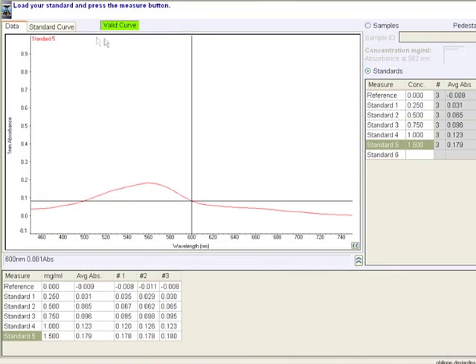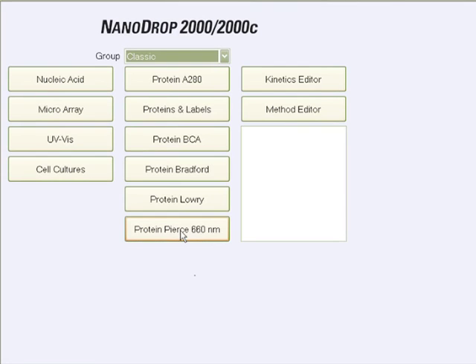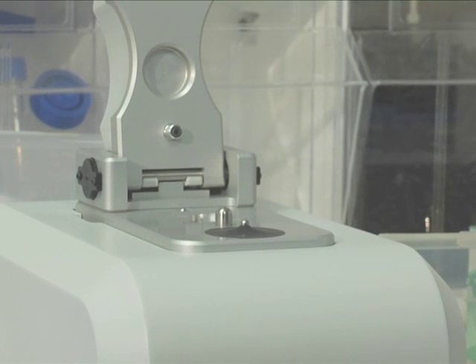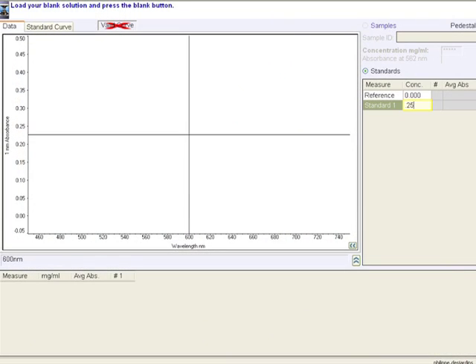Unlike the protein A280 method, the protein BCA method requires that a standard curve be generated before sample protein concentrations can be measured. To generate a standard curve, start by selecting the protein BCA method from the main menu. If the wavelength verification window appears, ensure the arm is down. Enter the values for each standard concentration in the right pane table. The software allows for the reference and up to 7 additional standards, and the reference and standards can be measured in replicates.